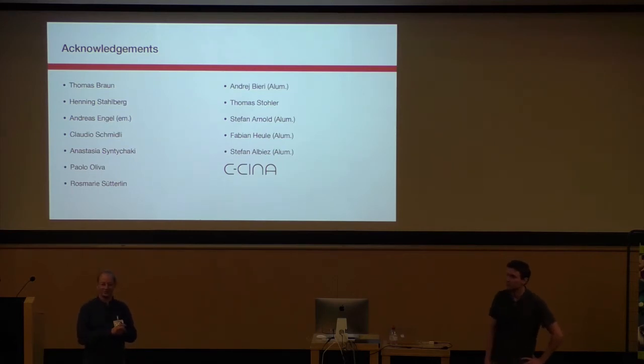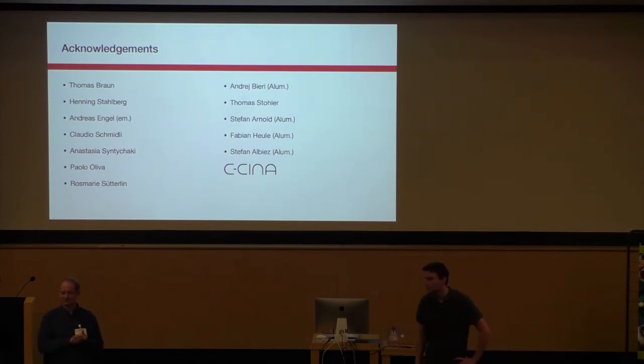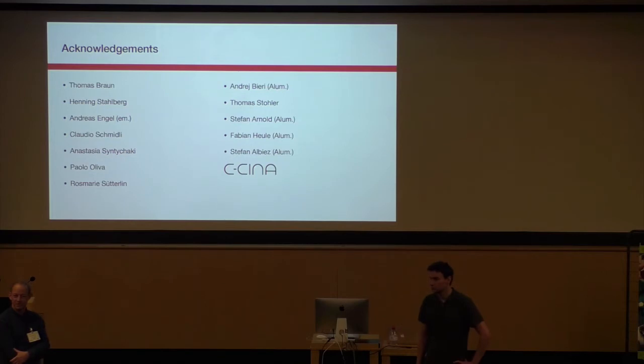One delicate issue when you do it now in the writer robot, the samples, is the thickness of the grid. Now I saw in your scheme that in one moment you adjust the thickness before doing the quick flash cooling. How can you precisely adjust this thickness mechanically?